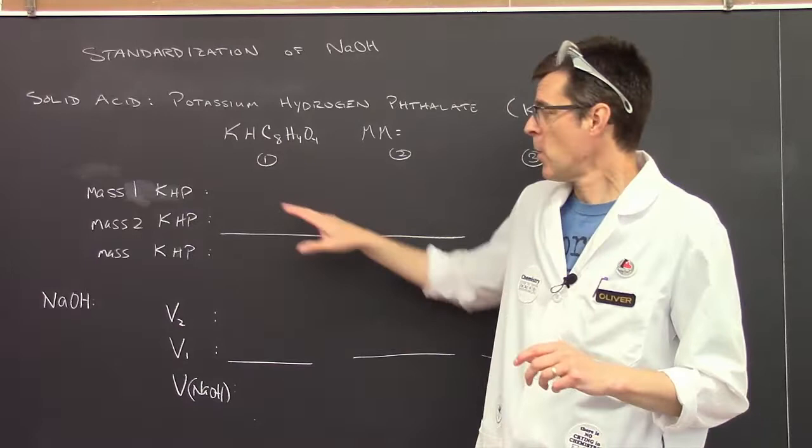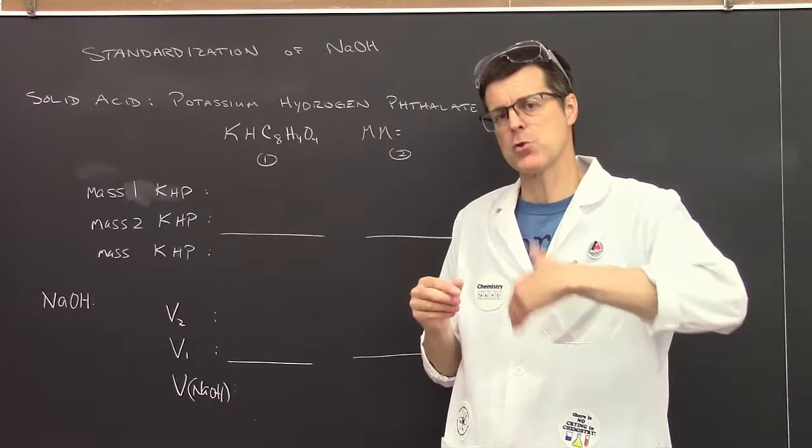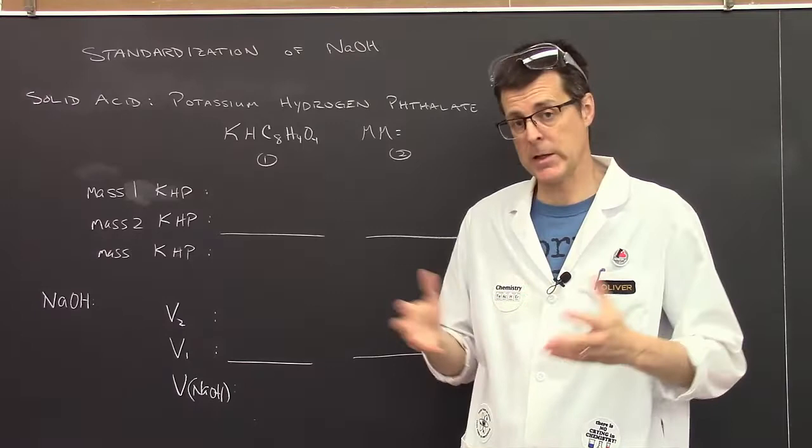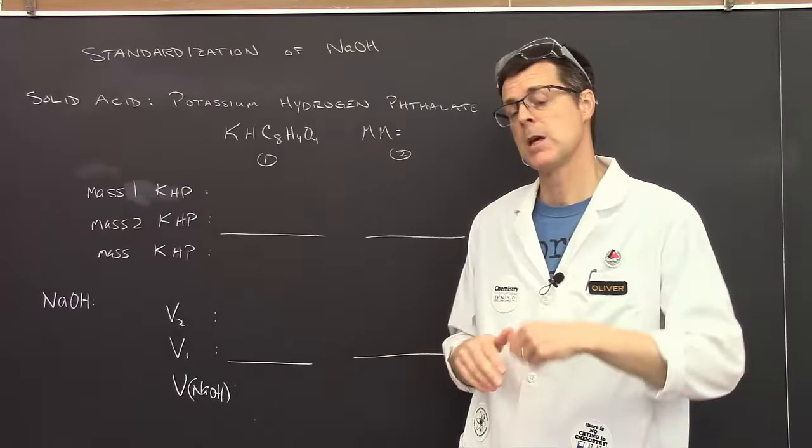We'll measure out some potassium hydrogen phthalate. I'm not going to measure it directly into the flask. I have a container with KHP already, and I'll find out what I've got to start, pour some into my flask, find out what I have afterwards, and then by subtraction find the mass.